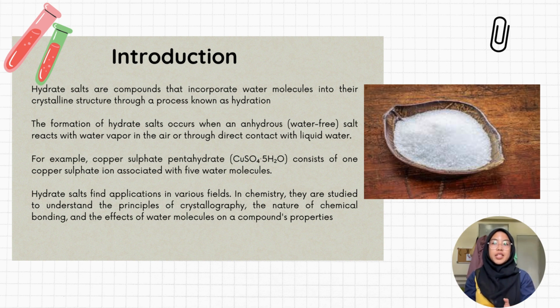For example, copper sulfate pentahydrate CuSO4·5H2O consists of one copper sulfate ion associated with 5 water molecules. The water molecules are an integral part of the crystal structure and they can be removed through heating or other dehydration methods. Hydrated salts find application in various fields.